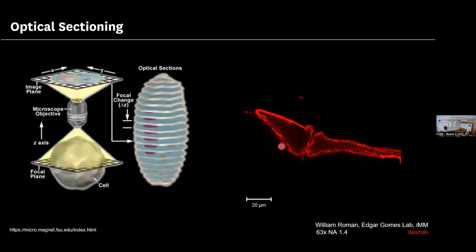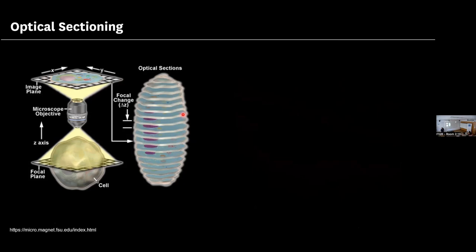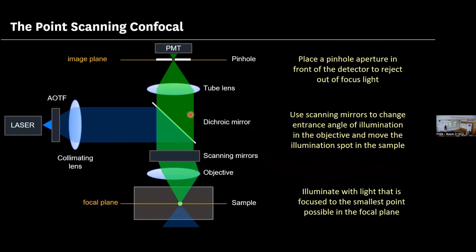I didn't understand very well the advantage of the crystal. The AOTF. Yes. Suppose that we always want to use as little light as possible, not to burn your sample, not to do photobleaching. On a wide field microscope, you control the intensity of the lamp. So you can also do this with the laser.